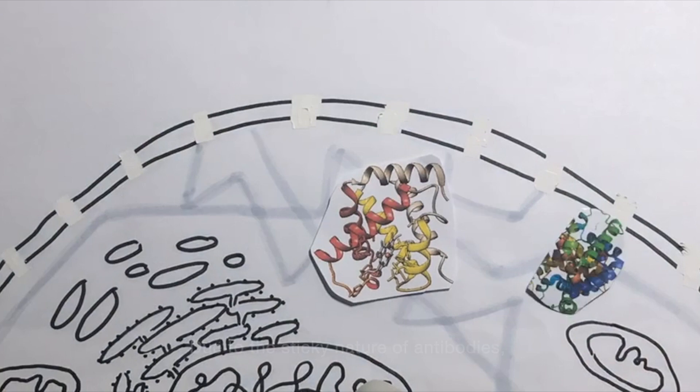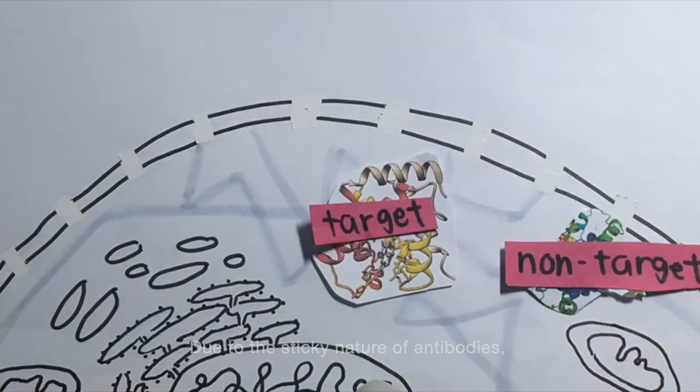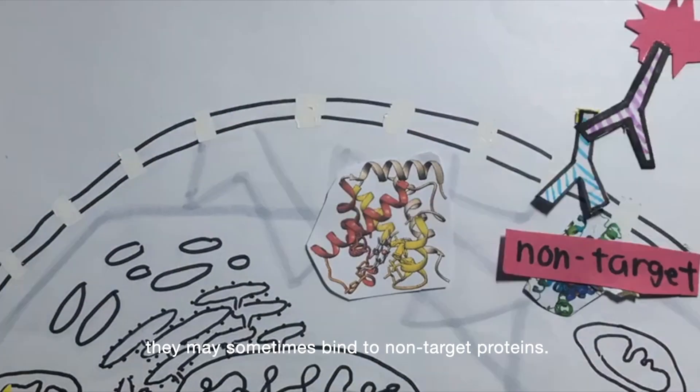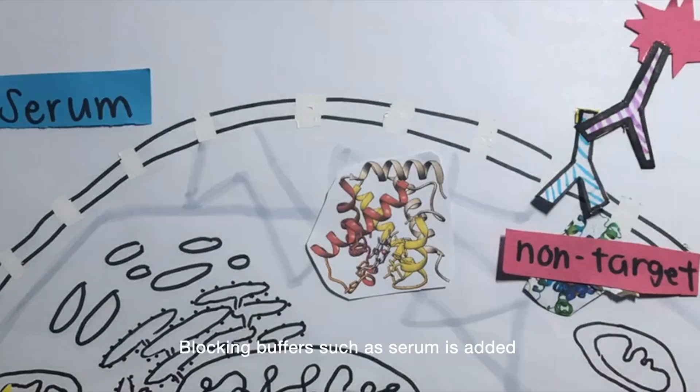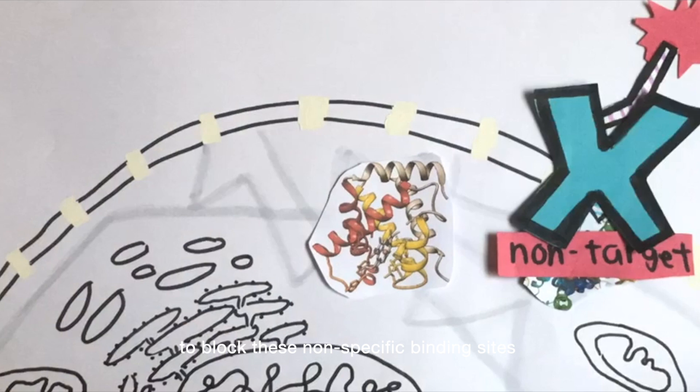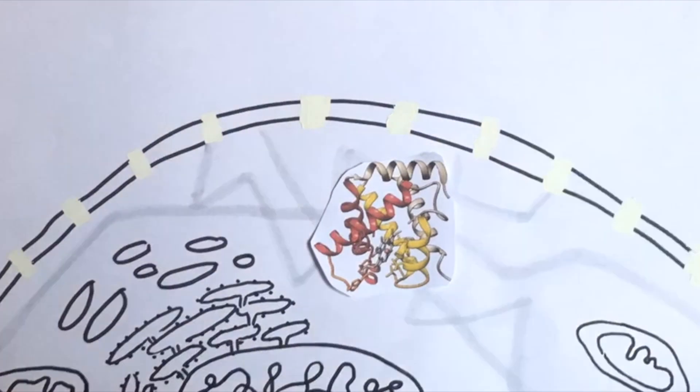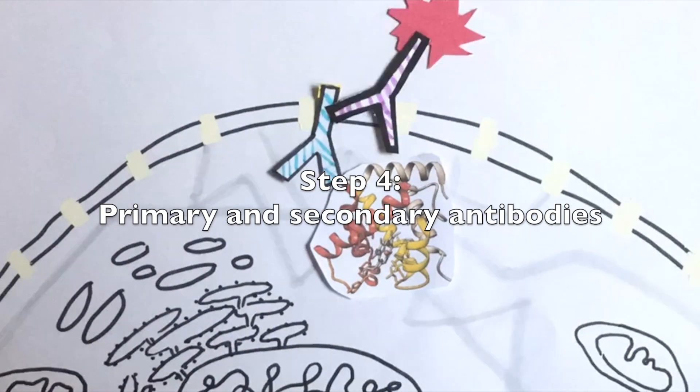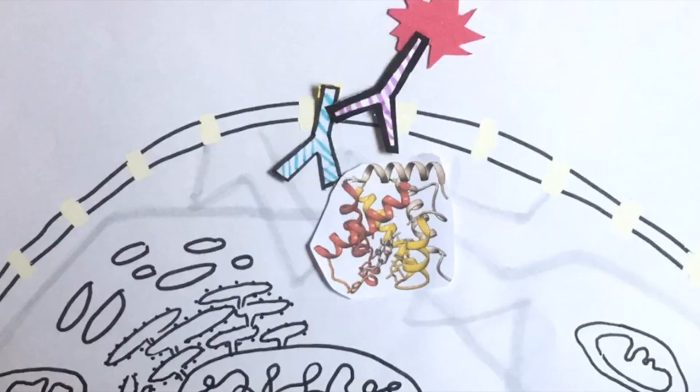Step 3, blocking. Due to the sticky nature of antibodies, they may sometimes bind to non-target proteins. Blocking buffers such as serum is added to block these non-specific binding sites, hence allowing scientists to locate the actual protein of interest. Last but not least, primary and secondary antibodies are added to visualize the protein of interest.